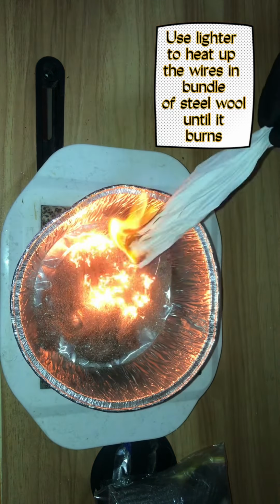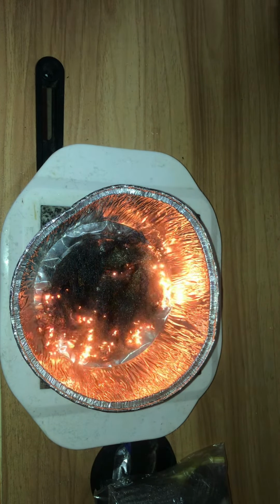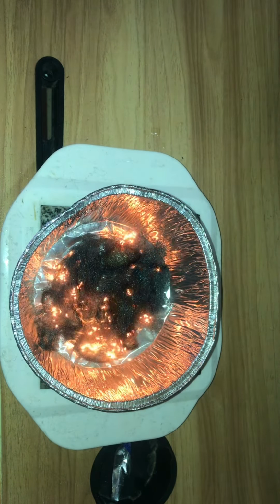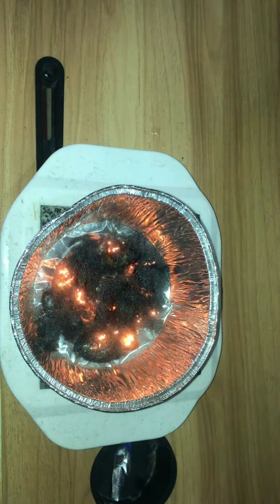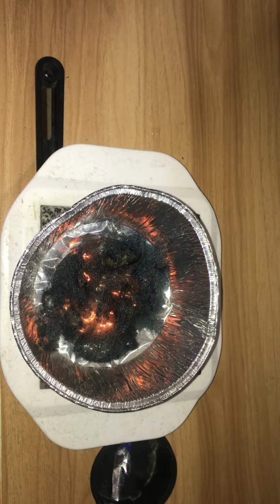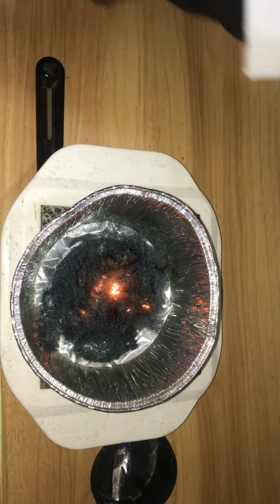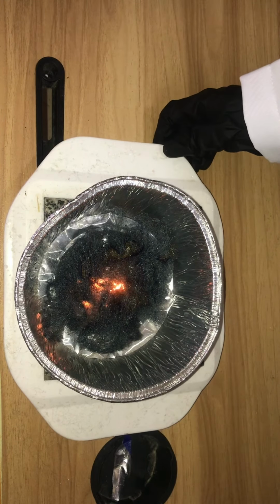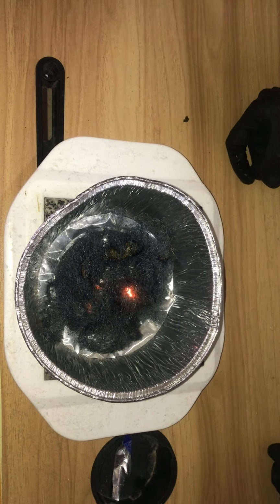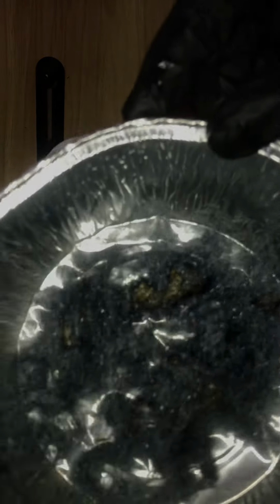Use the lighter to heat up the wires in the bundle of steel wool until it burns. And then record the observation after it burns.